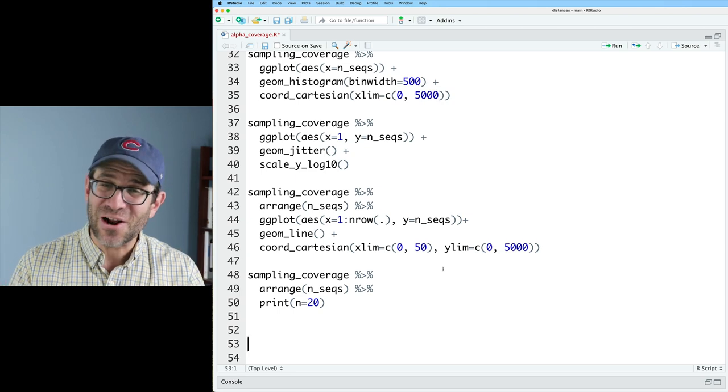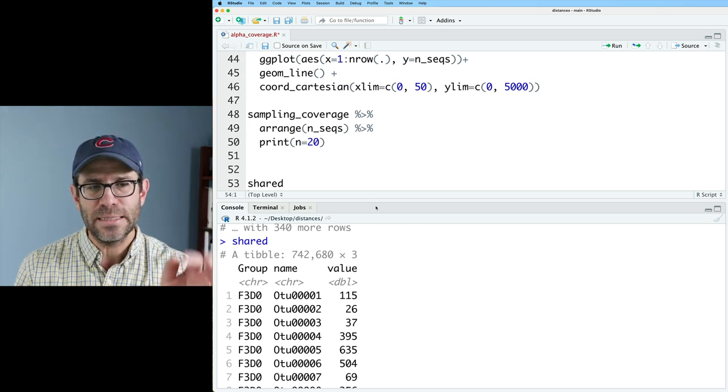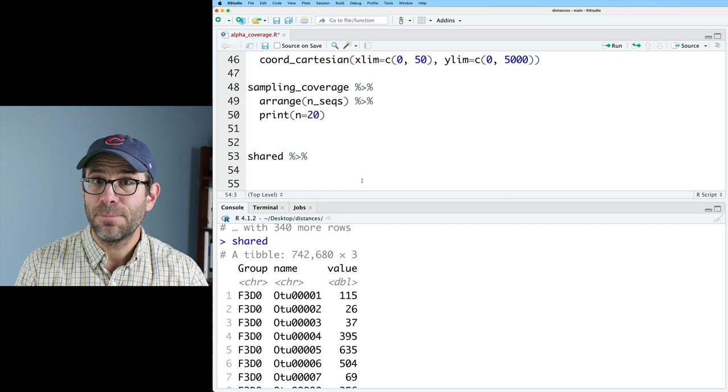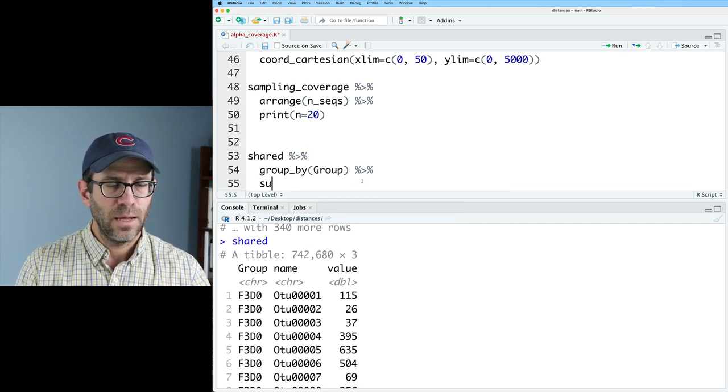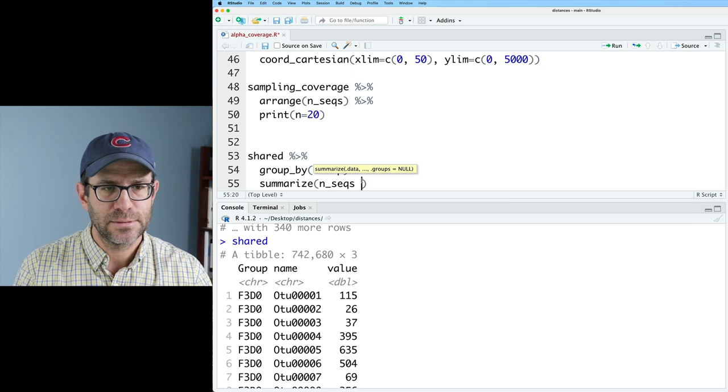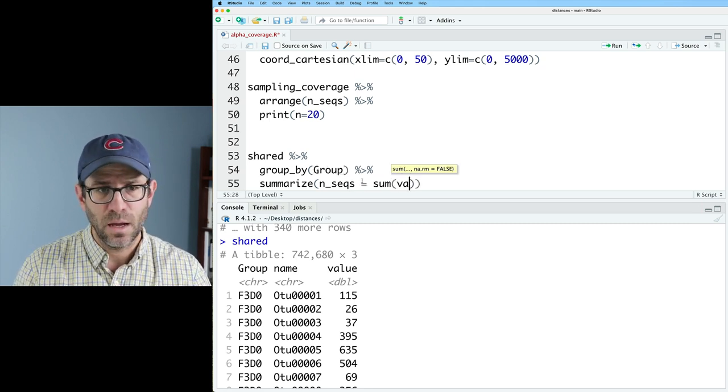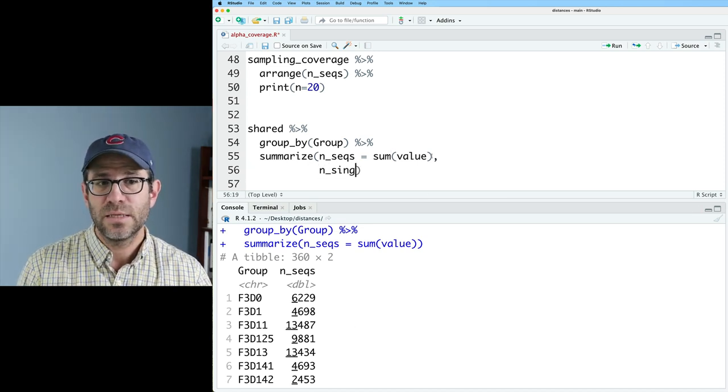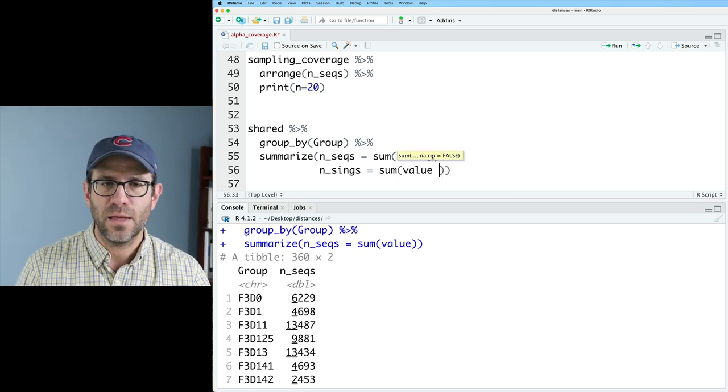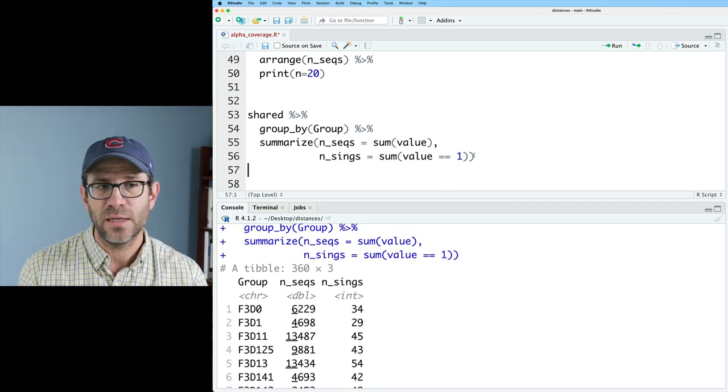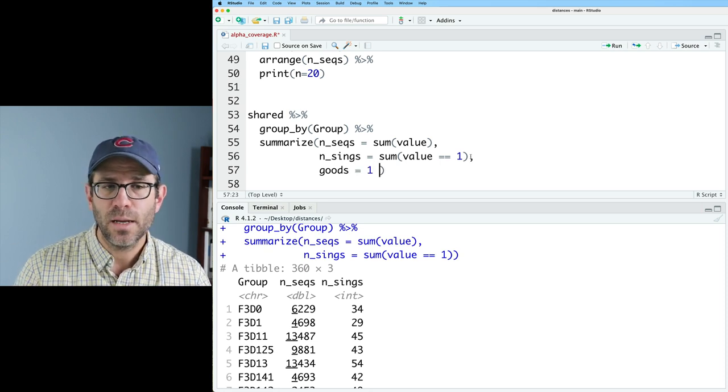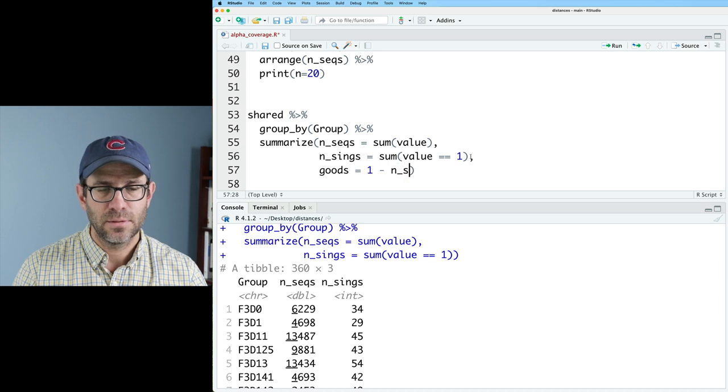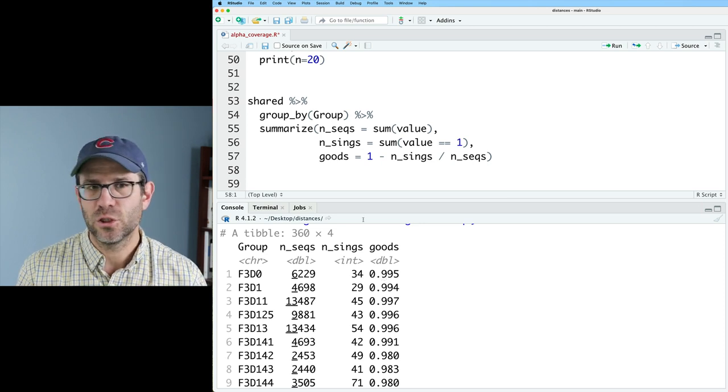Hopefully you did try that. So go ahead and take shared. And we know that again, we have this data frame with the group ID, the name of the OTU and the value, and we can then pipe this into a group by and we'll group by group and we'll do a summarize. And so we're going to get a few different values here. So I'll go ahead and get nseqs and this will be the sum of the value column. And so that's the number of sequences we have. I also want the number of sings, the number of singletons. And so that will be the sum of value equals equals one. And so these are the number of singletons that we have in each of our samples. And then we could do goods, so goods coverage. And that will be one minus the number of sings divided by the number of sequences. And so then this gives us goods coverage.